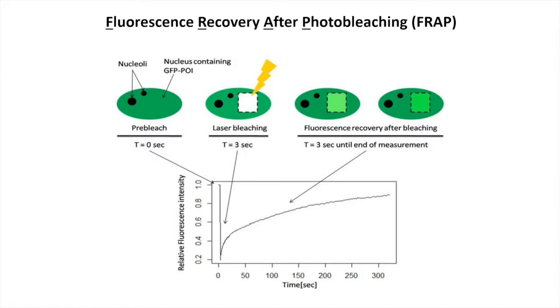From this curve you could estimate or measure, depending how you do your photobleaching, the diffusion coefficient of molecules and determine their mobile fraction. Partial recovery means there's some immobile fraction of molecules that don't recover. This has been a really important technique, and it's readily implementable in a number of systems.